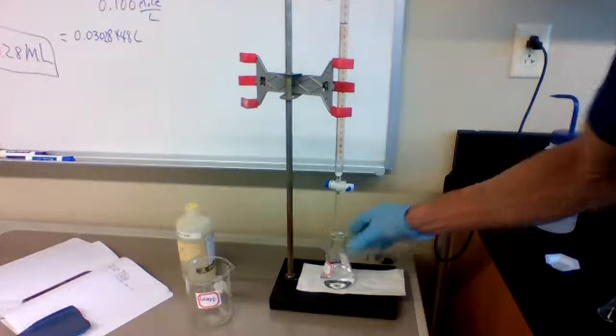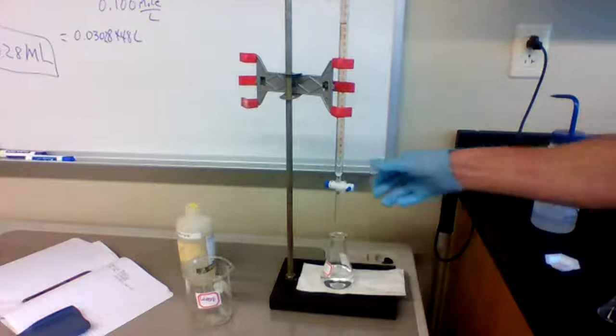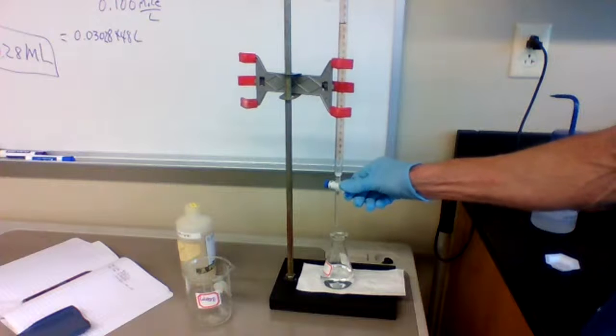Oh, almost there. We're right at 30, so I'm going to start adding drops at a time.